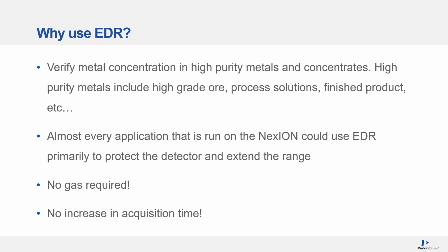And really, there is no drawback to using EDR. It requires no gases and does not add any increased time to your acquisition time. So it is a very, very simple way to allow an extension of the dynamic range.